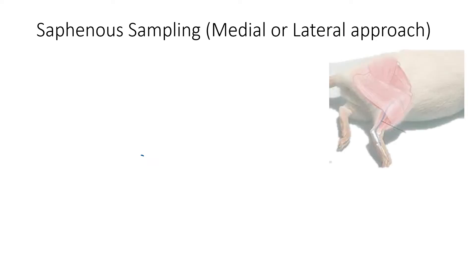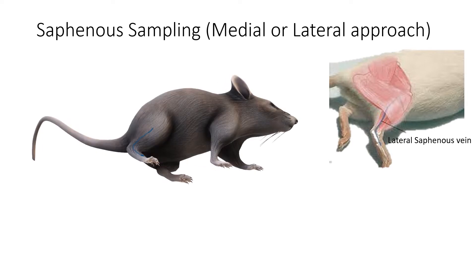The next method is saphenous sampling. We shave the leg of the animal and then locate the lateral saphenous vein. Once we locate the lateral saphenous vein, we collect the blood with the help of an injection.